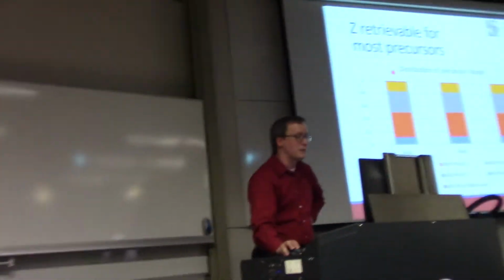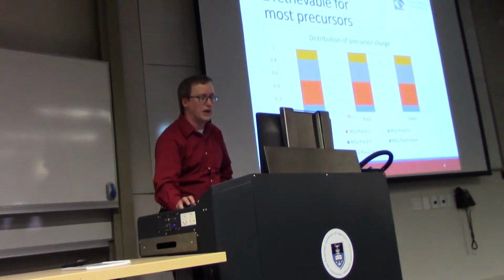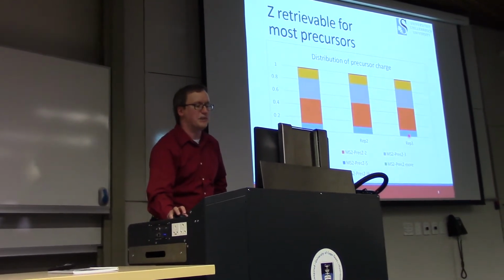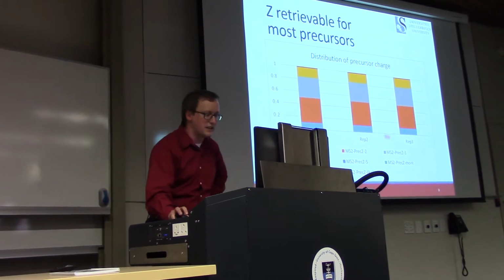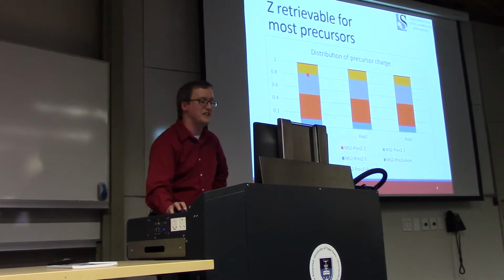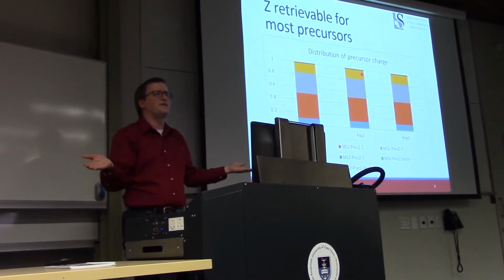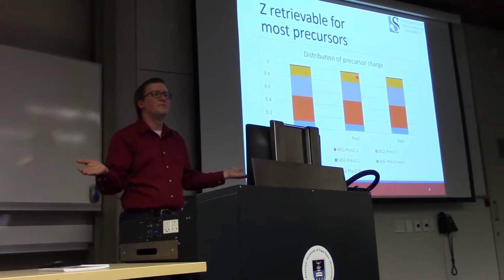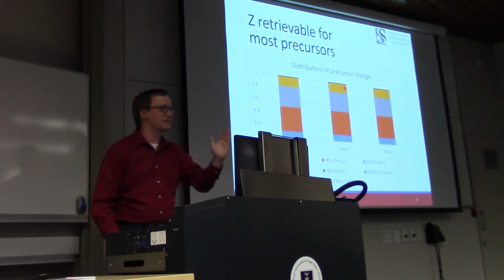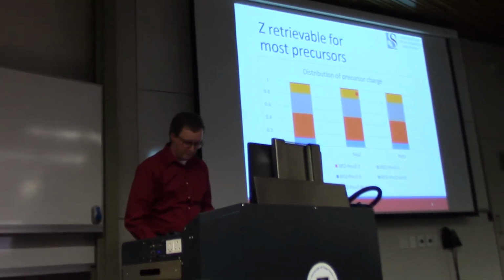We don't have a huge number of scans here for which we have an unknown charge. We have these blue in these 3 replicates of urines that I've mentioned, some number of +1s that make it into our data set. We have a fairly large number of +2s, a fairly large number of +3s, some number of charge 4s, but why don't I see any charge 5 or charge 6? I restricted them out. I forced the software to show me nothing bigger than +4. So we can see then that we're getting this distribution to work from.